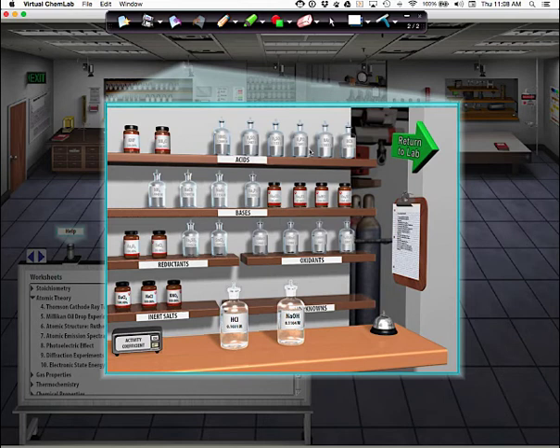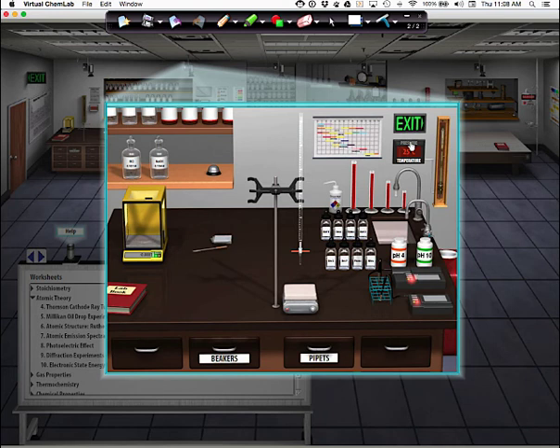All right, so now guys, we're done with step 6, on to step 7, return to the lab. You'll notice there's an arrow right here, and check out what happens. When you go back to the lab, there's the bottle as you just set on the counter, and now here are all the indicators that you could use to do this titration. All right, so now we're ready to go on.